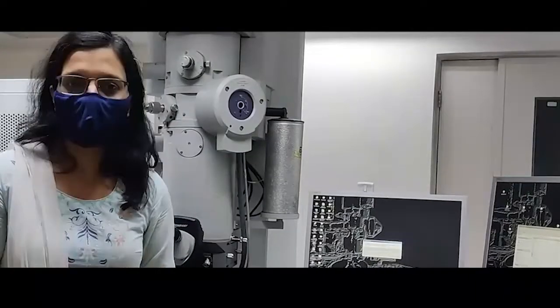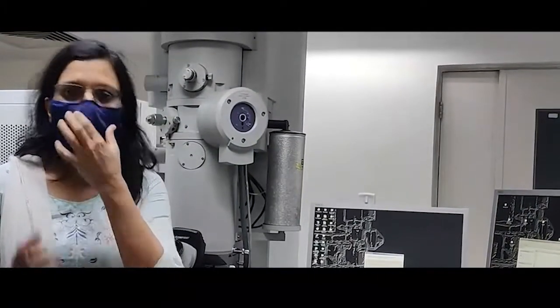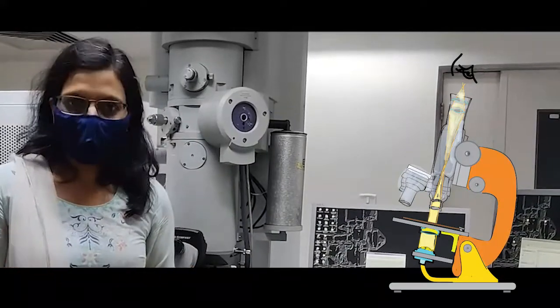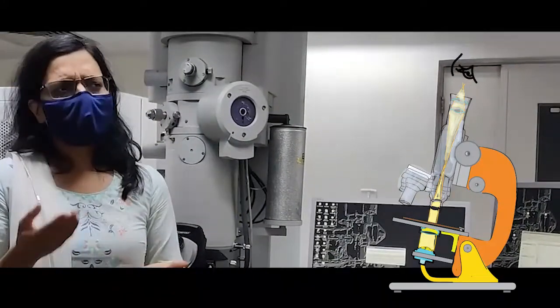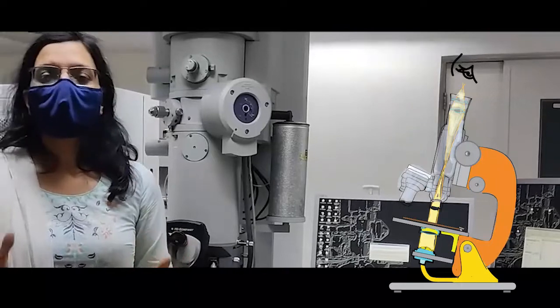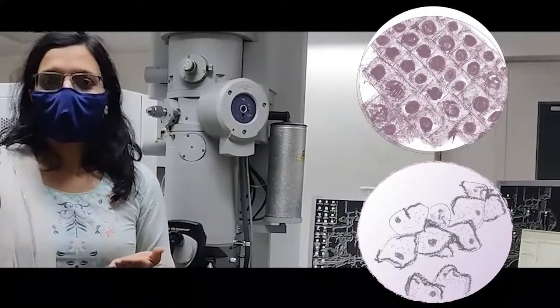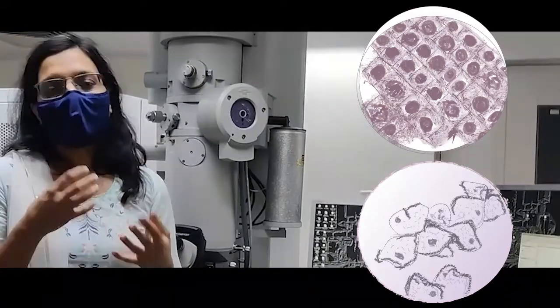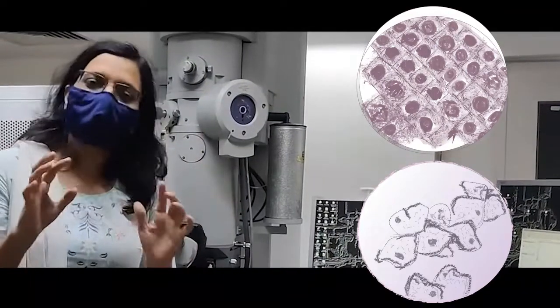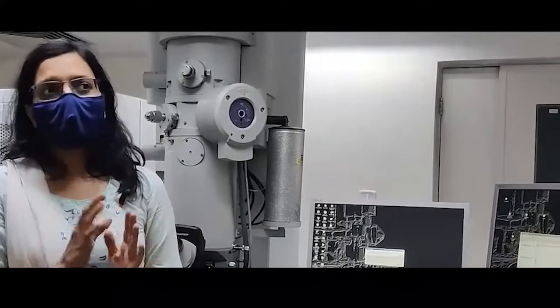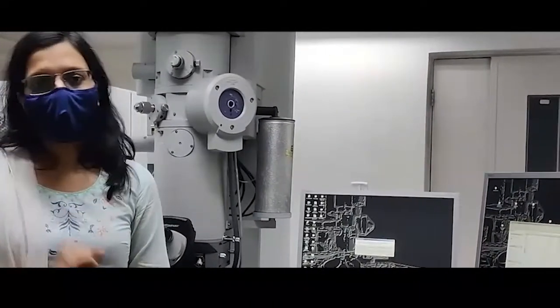This is called a compound microscope which is nothing but a kind of a light microscope. The source of illumination there is light and usually I am sure you must have visualized samples like root tip or cheek cells on that and you must have seen the cell boundaries very much here. You can also see the nucleus and I am sure you must have seen these kind of samples in your laboratory.